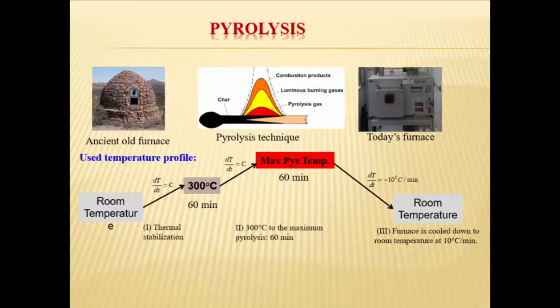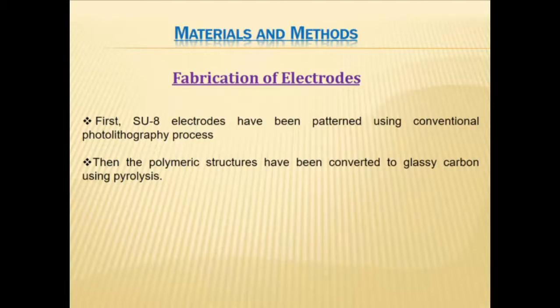So this stage is very important. We are getting a conductivity of around 2.7 times 10 to the power 4 Siemens per meter. This is quite good. It is not comparable to metals like gold and others, but it is good for this kind of application. So now back to our work which we have done.